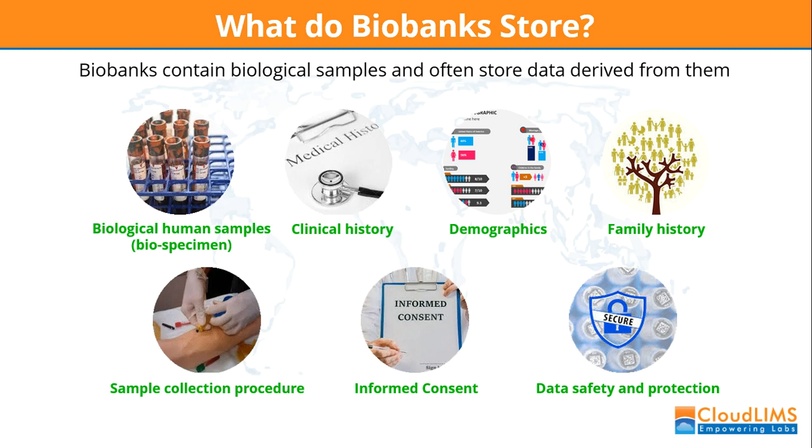What exactly do biobanks store? The biobanks that we're talking about specifically here are ones involved in medical research, because our biorepository itself is part of a medical school. But indeed, a biobank can store a range of biological samples, like in a museum, for instance, with historical samples, or agriculture with agricultural samples.